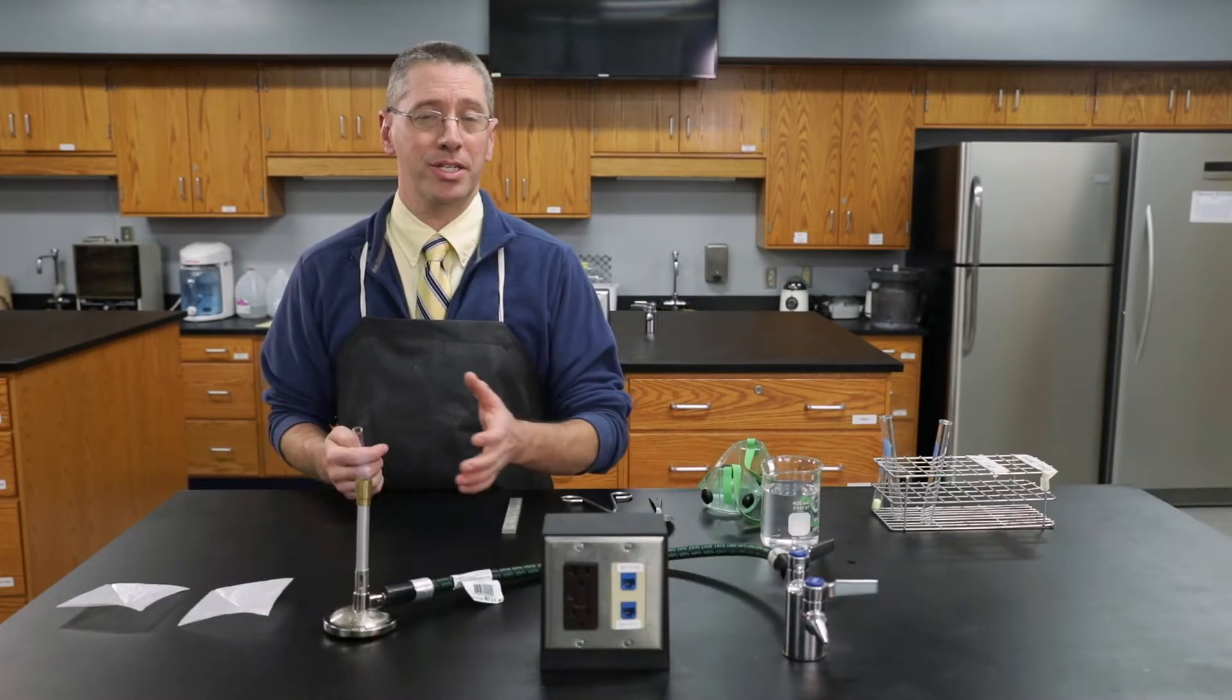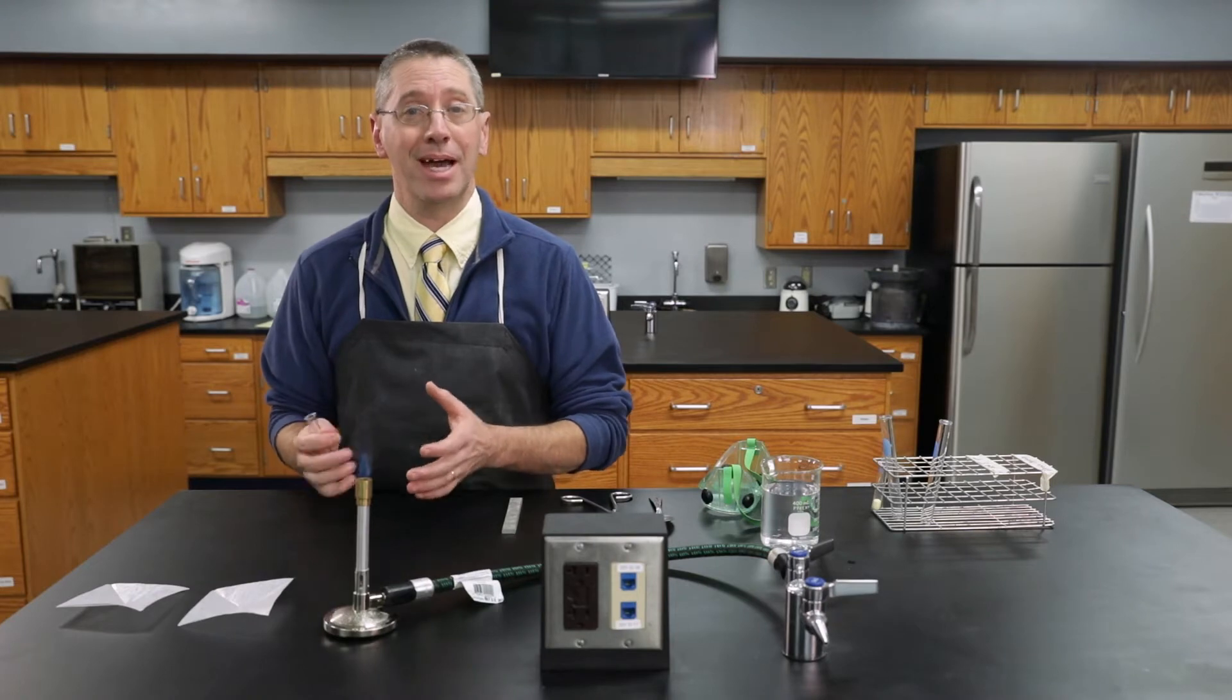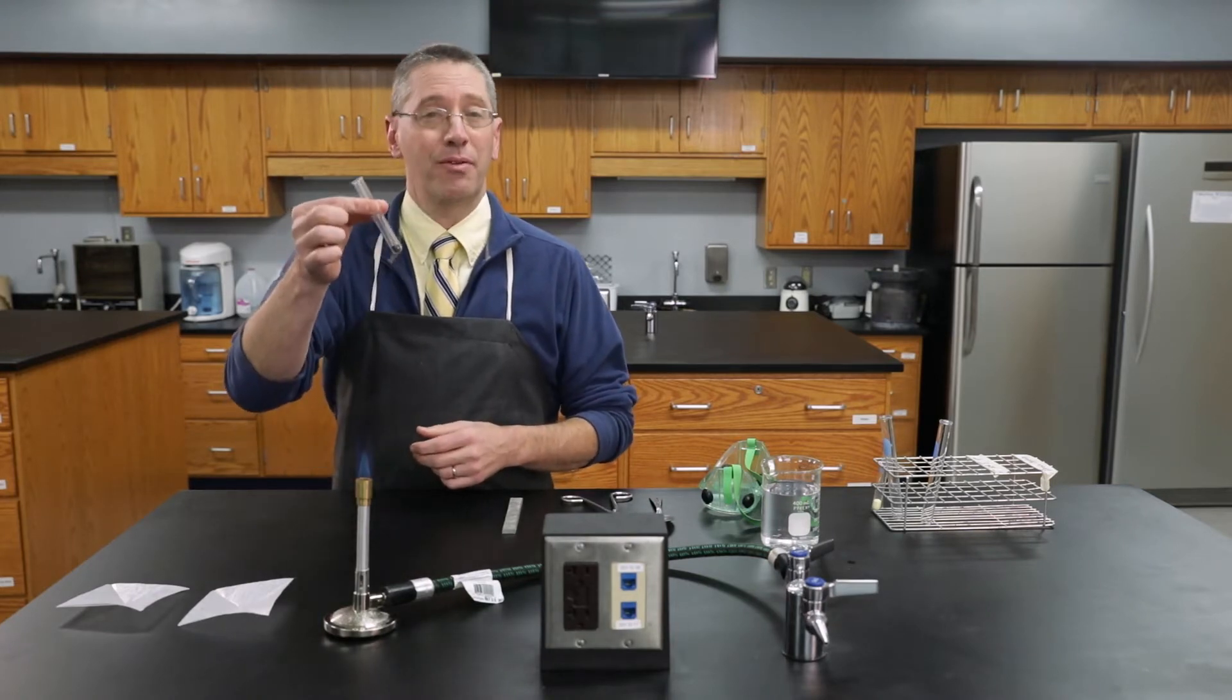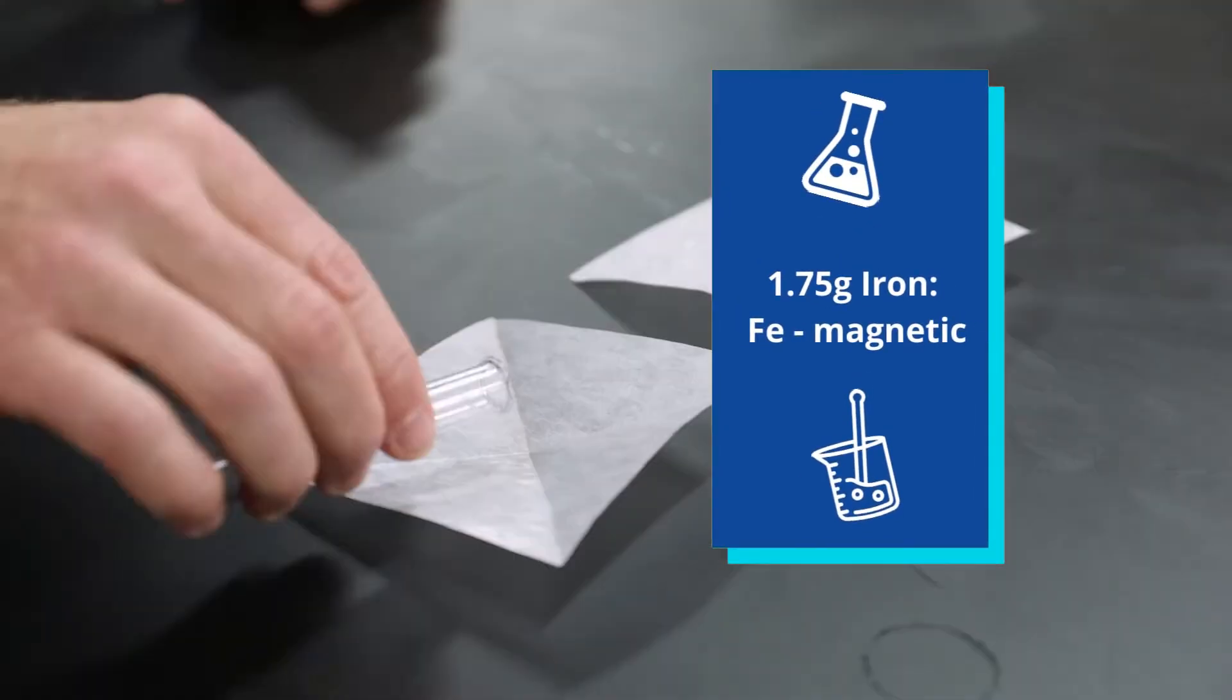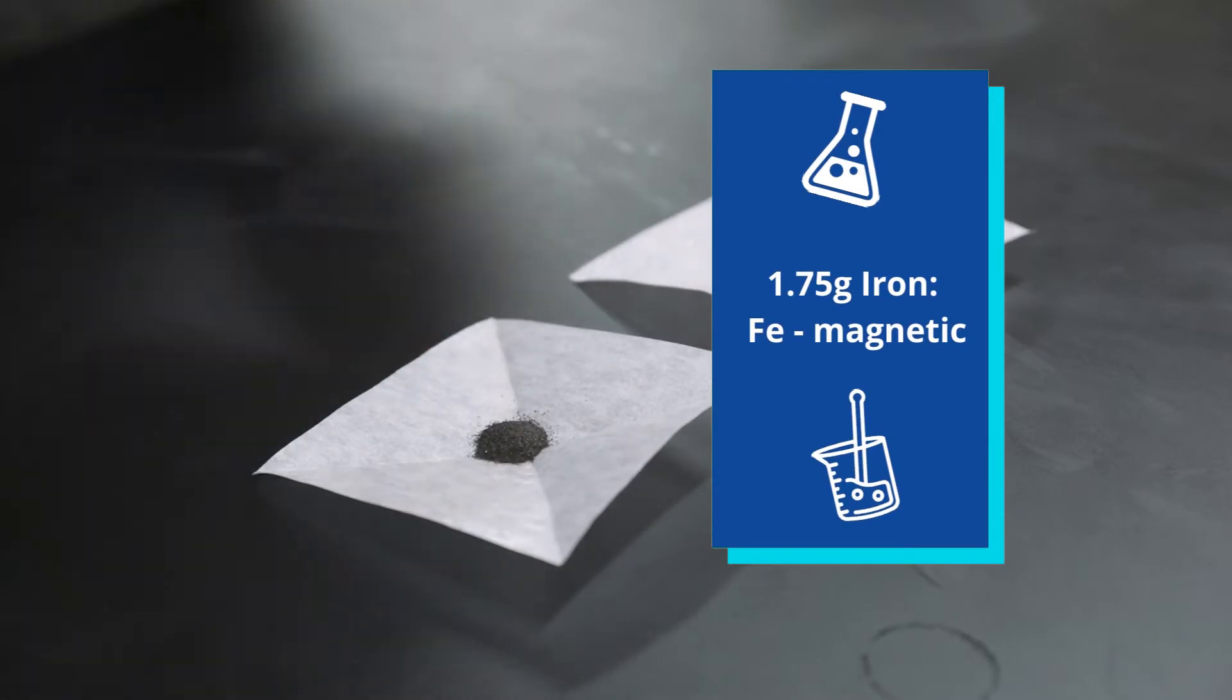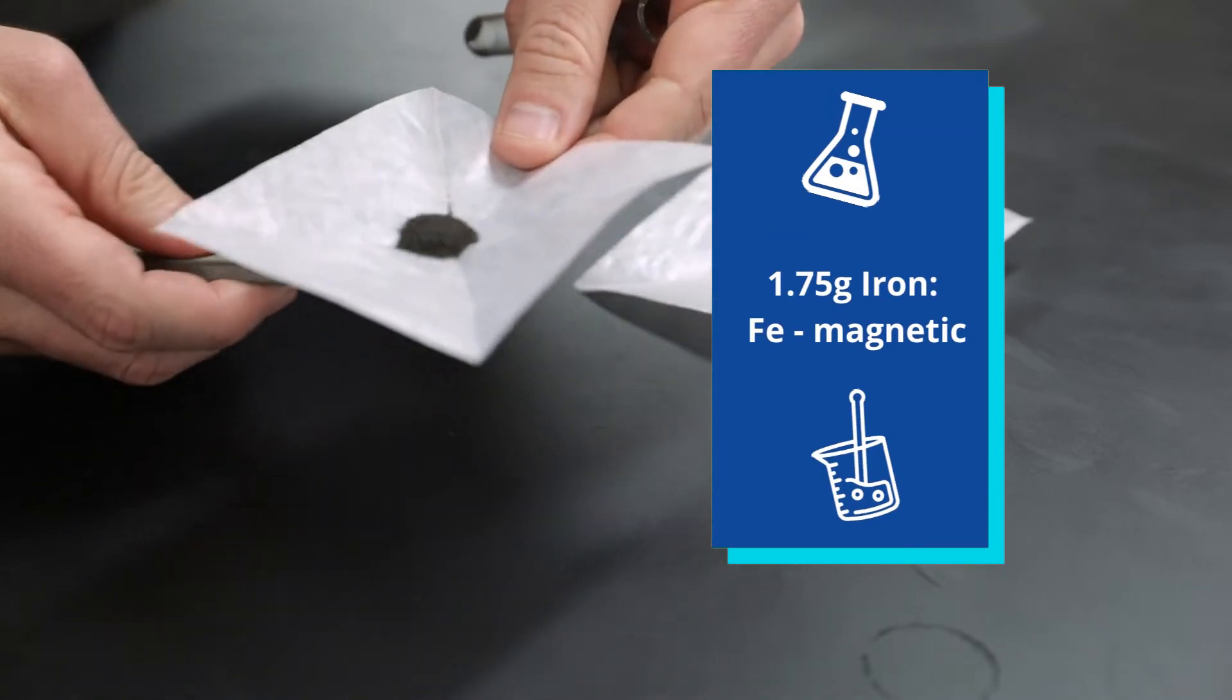In general terms we say element A plus element B produces compound AB. Here we have 1.75 grams of iron which is a gray metal and it's magnetic.